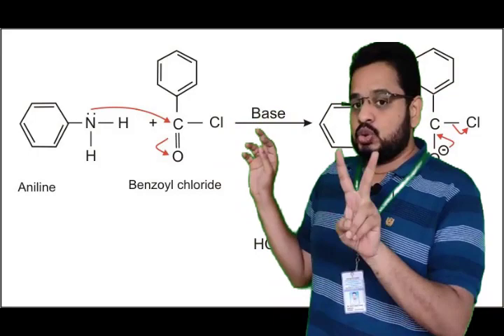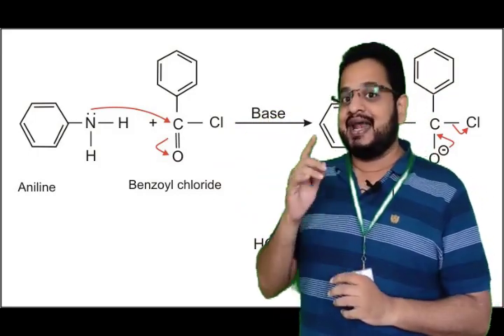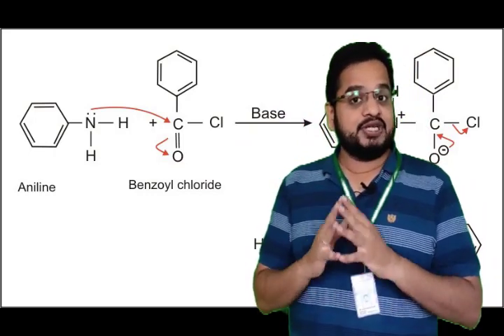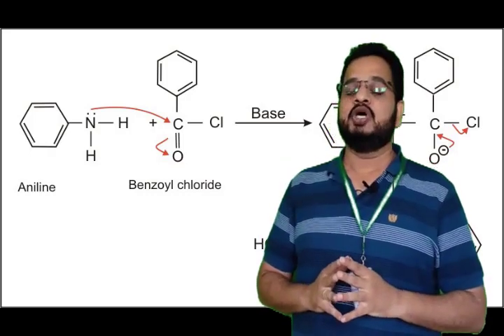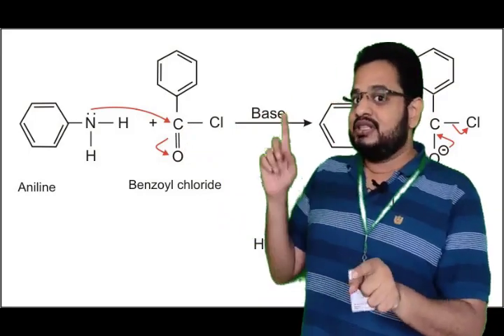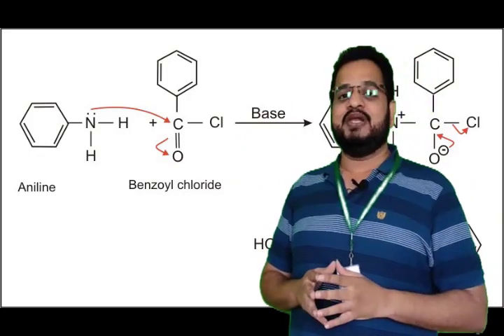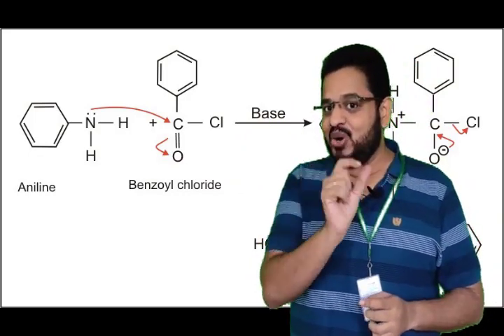However, there are two things which are still pending. One is the hydrogen and the other one is the Cl. We are using 10% sodium hydroxide solution in this synthesis reaction. So what is happening? The chlorine from benzoyl chloride will react with this sodium, forming sodium chloride, which is completely soluble. At the same time, sodium hydroxide has another OH group.